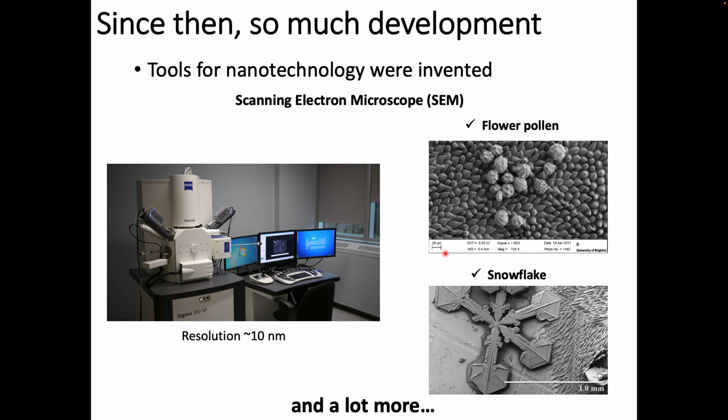If you use an optical microscope, the source is essentially visible light, and with that you can get the different color spectrums that we can see. But with an electron microscope, either scanning or transmission, you are irradiating electrons. The electrons come out of the electron beam and hit the sample.